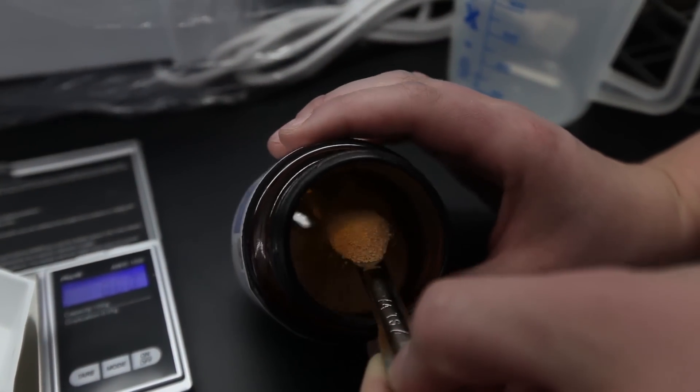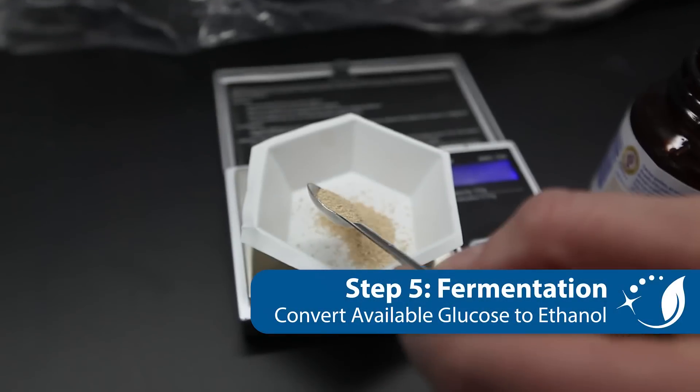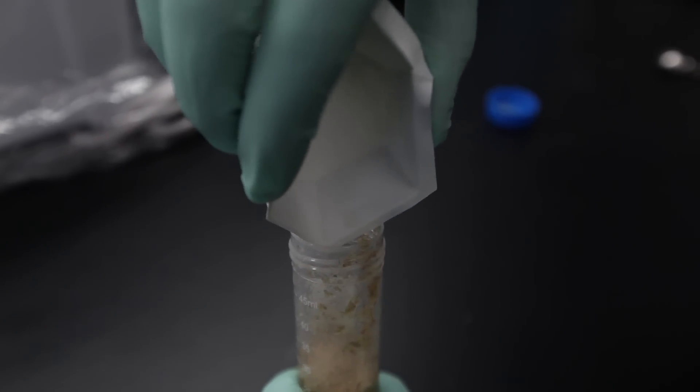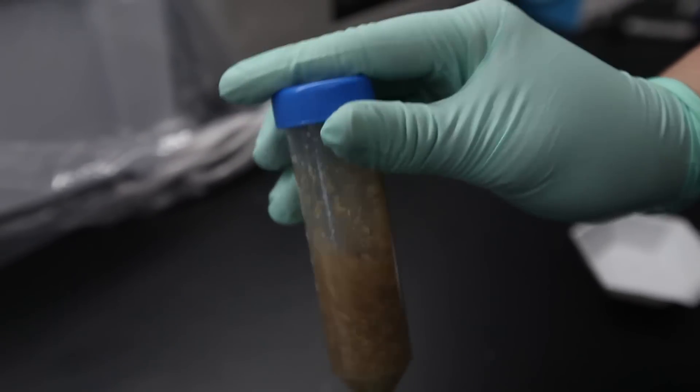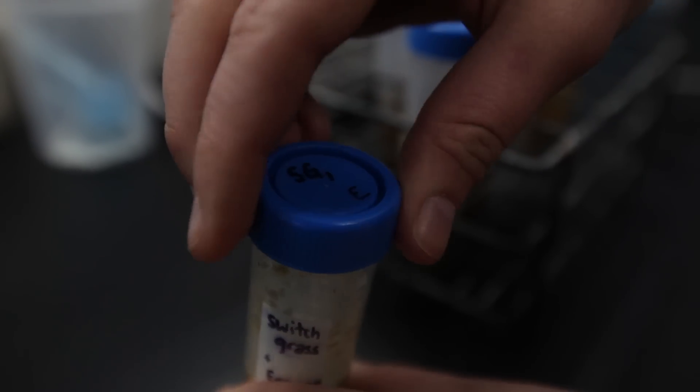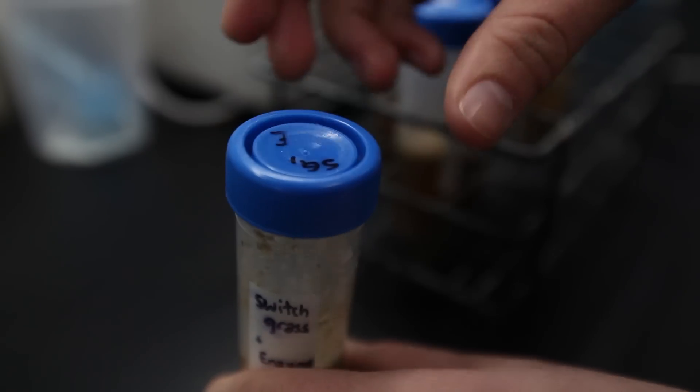The fifth step is to add yeast to the samples and begin fermentation. Measure out roughly one gram of standard baker's yeast and add it to each sample tube. Make sure to shake thoroughly so that the mixture is fairly homogenous. After shaking, it is important to loosen the cap slightly so that the pressure doesn't build up during fermentation. This could skew your results.